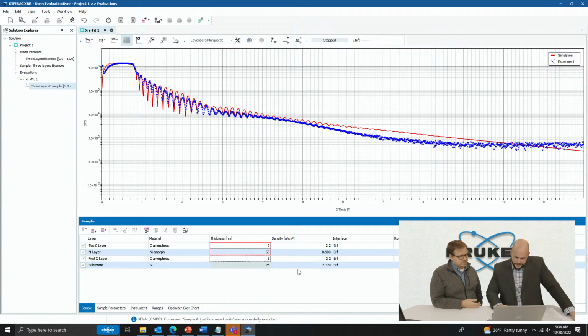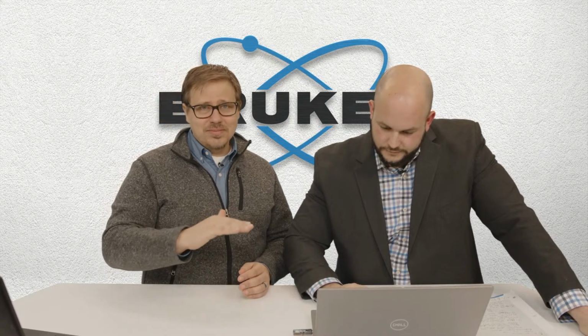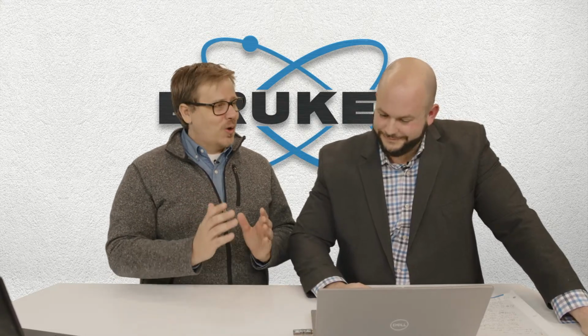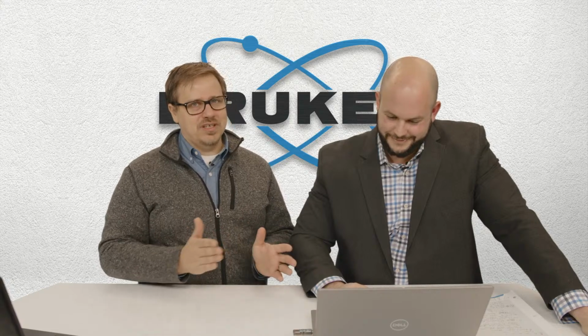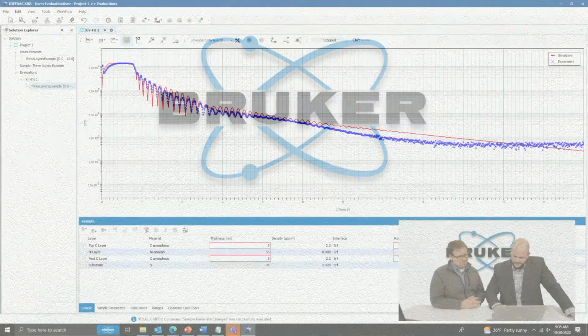Let me not forget to do that. Let me just double check here. There we go. Go back to roughness. Okay, I think I'm going to switch this over to 0 though. Yeah, while you're filling that out, one thing I like to do with density is look at that critical edge. If your top layer's critical edge is really off, you either have to have a really good reason for that, or when you scanned, you probably have an offset in there. So you'd have to offset the data to try to get some results out. That's right.